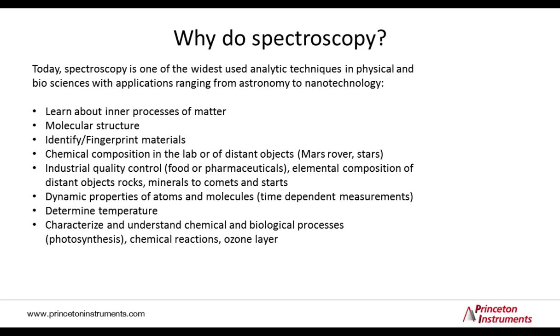Investigations of dynamic properties of atoms and molecules, like in time-dependent measurements. Spectroscopy can help to determine temperature of an object, and in general characterize and understand chemical and biological processes, like chemical reactions, for example.